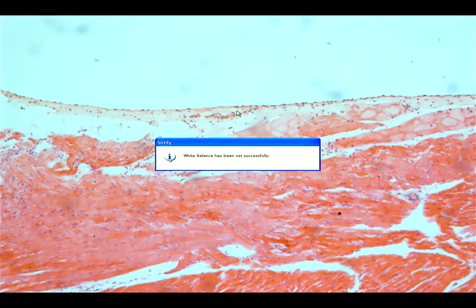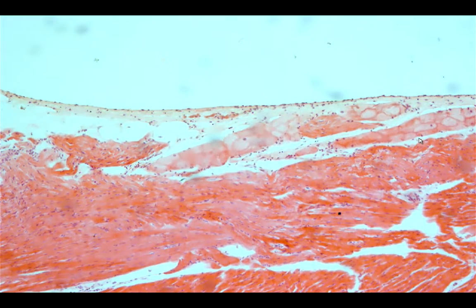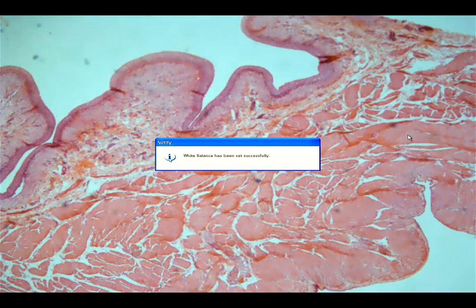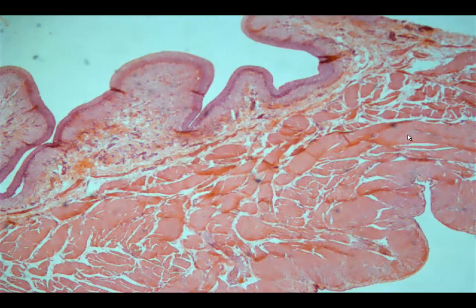Okay, it's in the endocardium, subendocardium portion. There, subendocardium portion. Okay, so our last muscle type would be, where is it? Wait, it would be the smooth muscle. Okay. So the smooth muscle, what are the features of the smooth muscle?